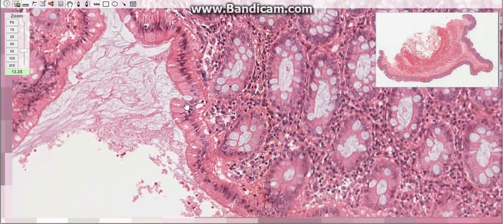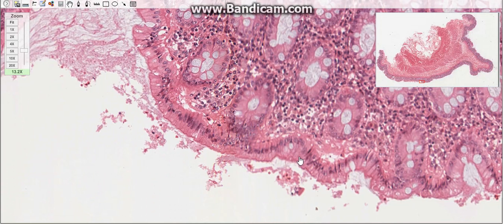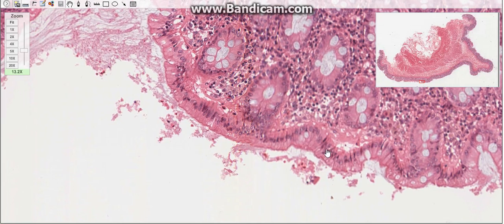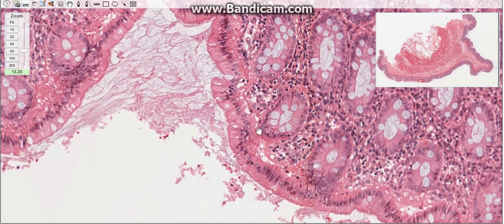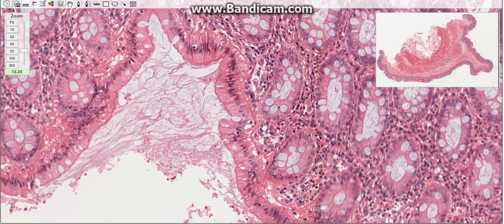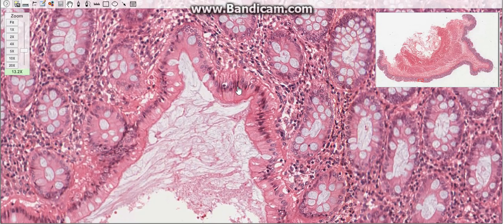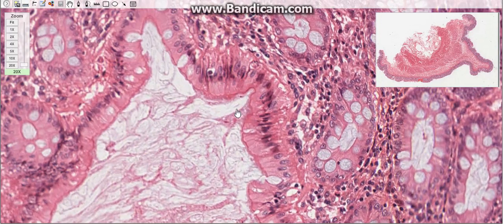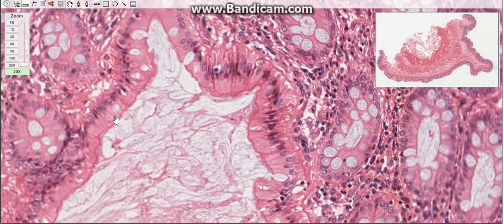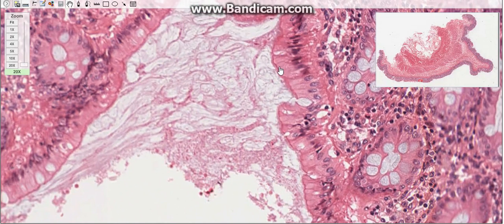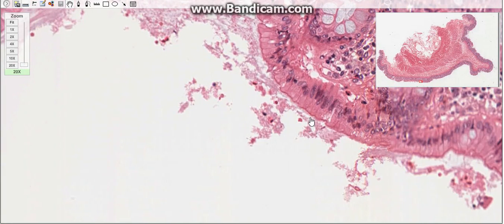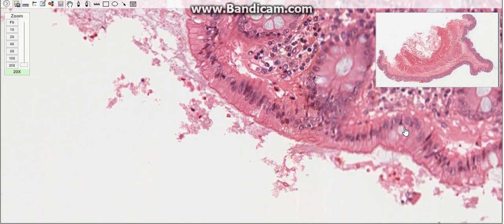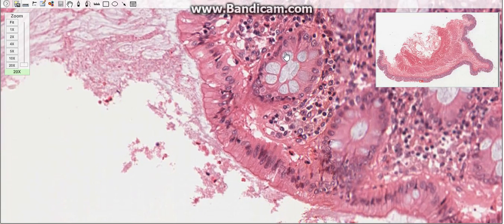The epithelium of the large intestine consists of several cell types: absorptive cells, goblet cells, stem cells or undifferentiated cells, and enteroendocrine cells. The absorptive cells are tall columnar and have short, irregular microvilli. They actively transport electrolytes, and water passively follows the electrolytes. Goblet cells are more prevalent in the crypts than along the surface.